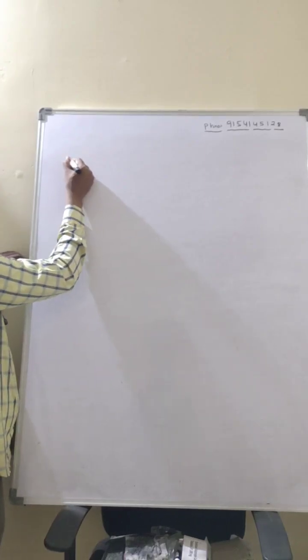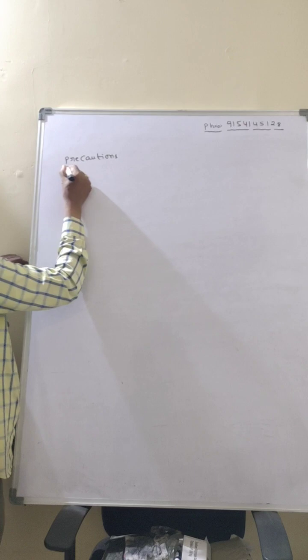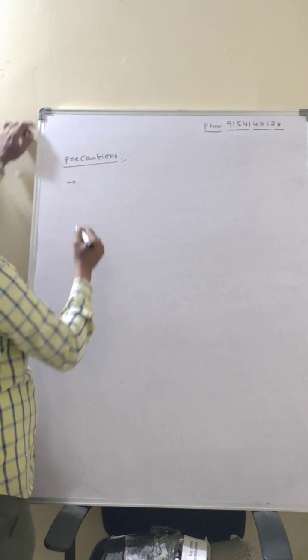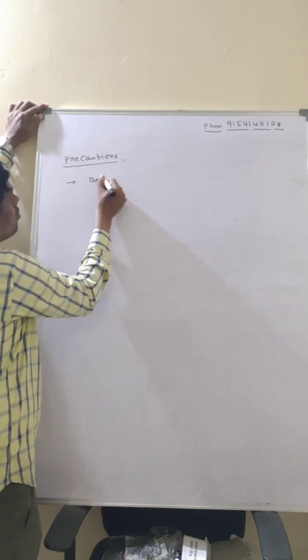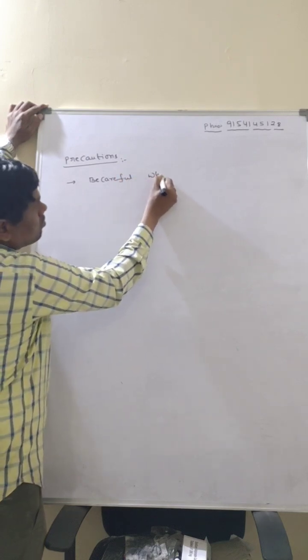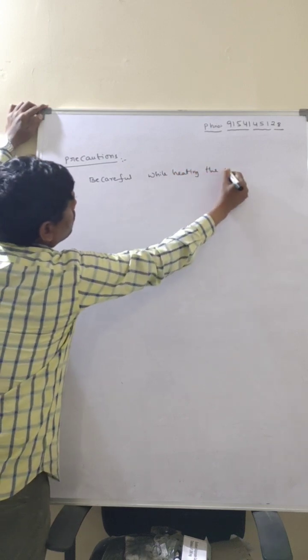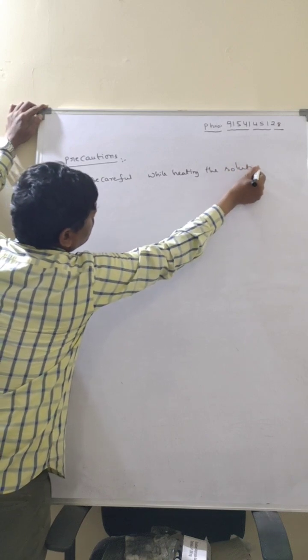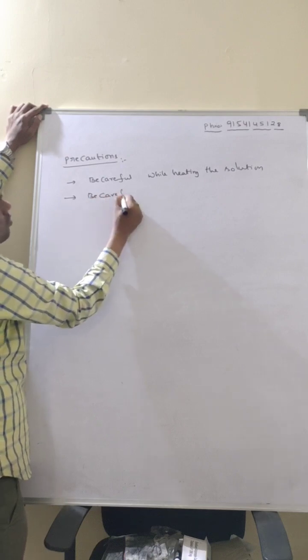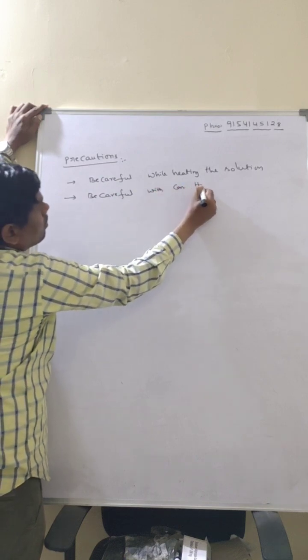Precautions. Be careful while heating the solution. Be careful with concentrated sulfuric acid.